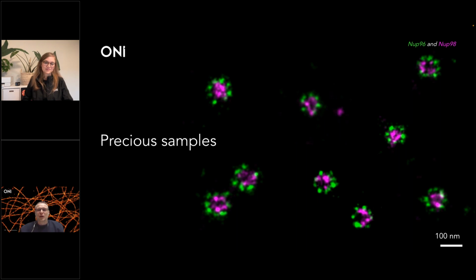Chlorophyll will absorb in the 488 channel, but also in the 640 channel. So any laser you use to activate your fluorophores will just increase the autofluorescence within a plant cell. Unfortunately, I would not recommend doing STORM imaging in plant cells, as you will get a lot of non-specific autofluorescence from the cell. That's a good thing to keep in mind.